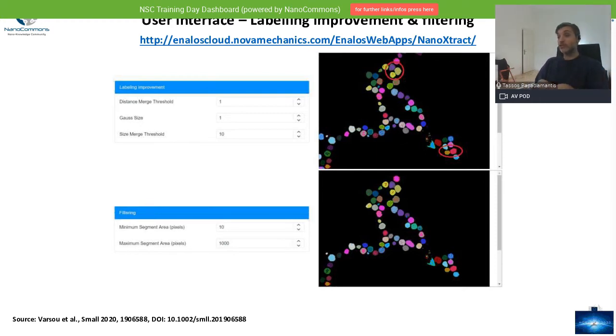So let's say if you have something like this here, an artifact or a huge plate out of nowhere, then you can use this so as to remove all these outliers and get a clearer image with more uniform sizes and shape.